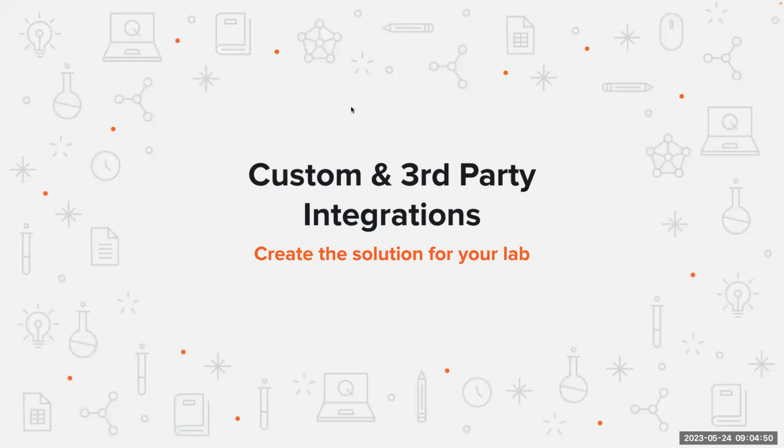Right. So today, again, we'll be going over our custom and third-party integrations. So these are our more custom built, take a little bit of steps instead of the out-of-the-box integrations, like we went over for the Benchling integration would be one example of an out-of-the-box integration.